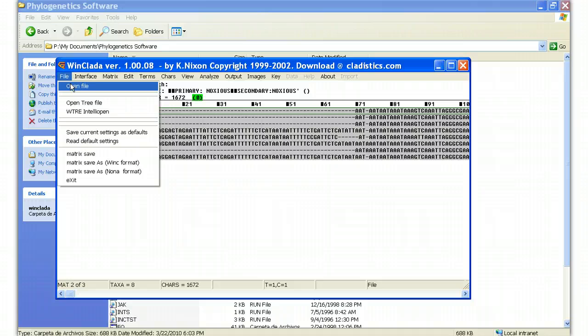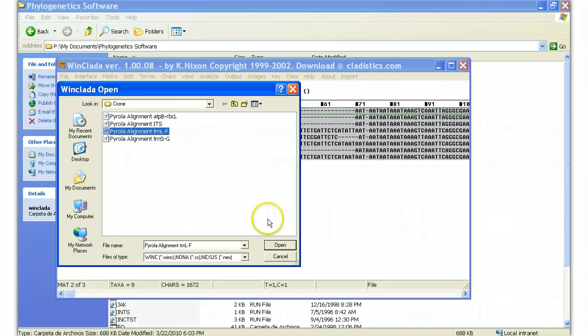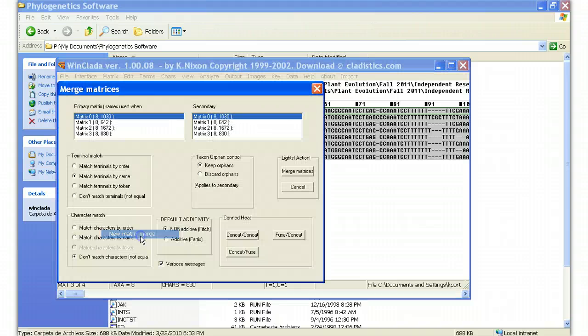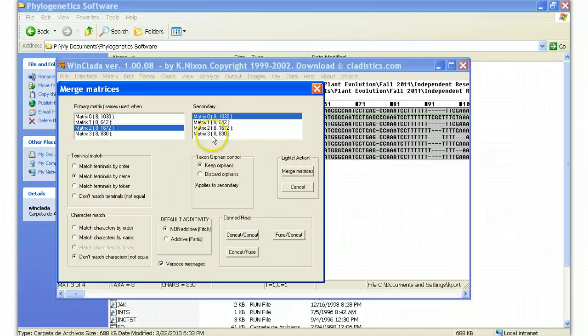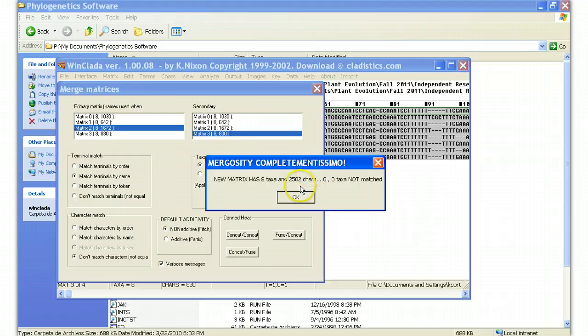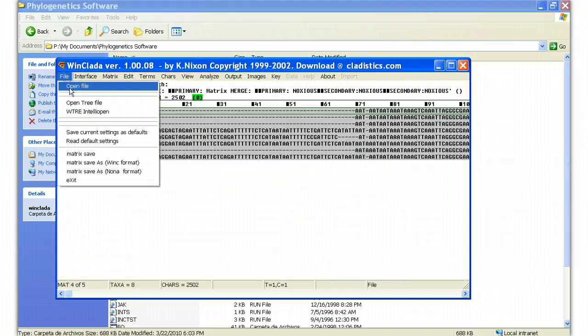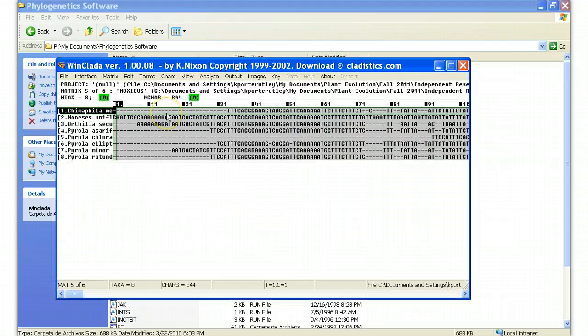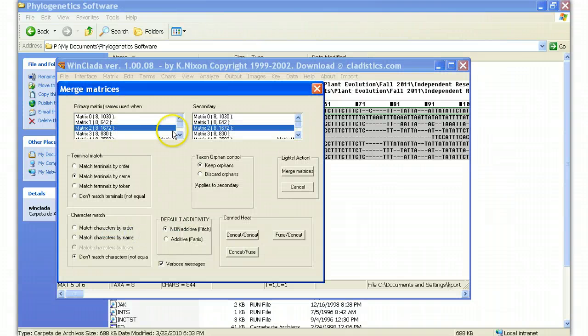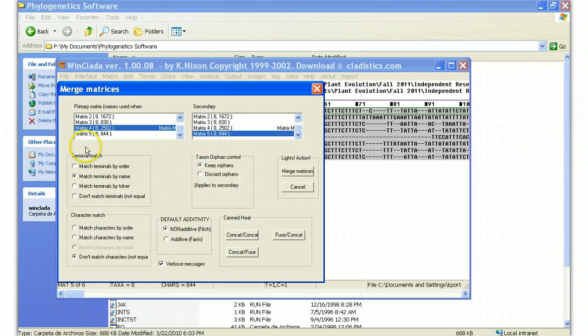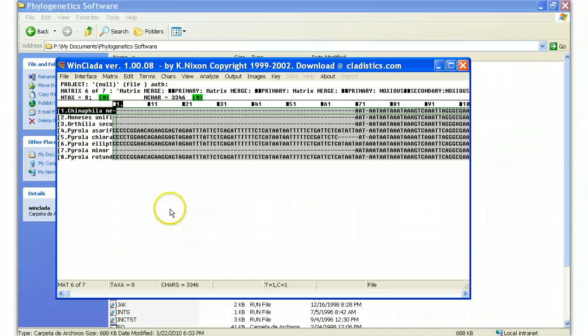But we have two more matrices to add. So I select the next one down, which is TrnLF, select open, go to matrix, new matrix, merge. This is our merged matrix of these two matrices. This is the new matrix. I'm making sure that match terminals by name is selected and keep orphans is selected, and I say merge matrix. Then I do the same thing for his last file. This is his TrnSG data. Now I want to merge all of the data together. Here is the merged matrix from before. Here is the new matrix here. Match terminals by name is selected and keep orphans is selected, and I say merged matrices.